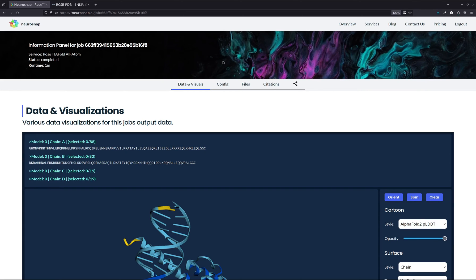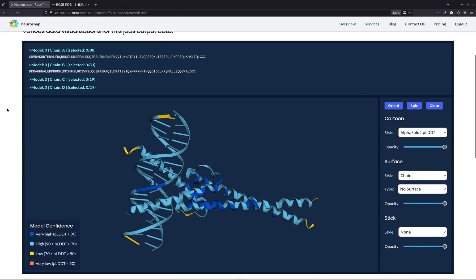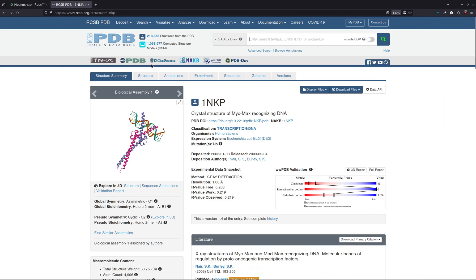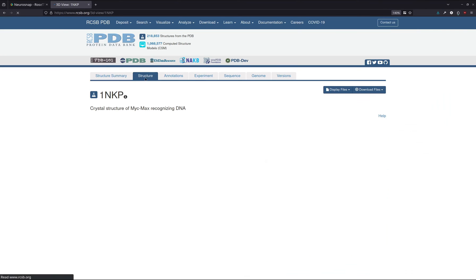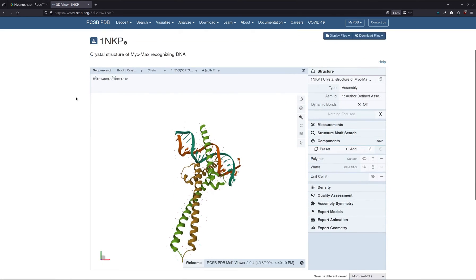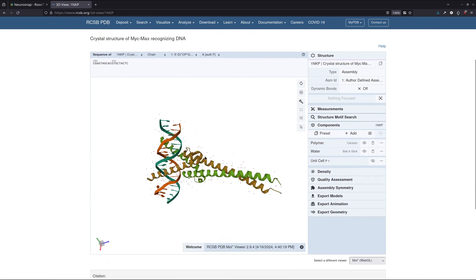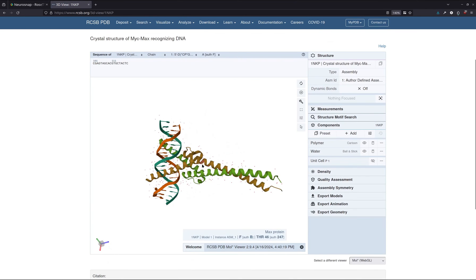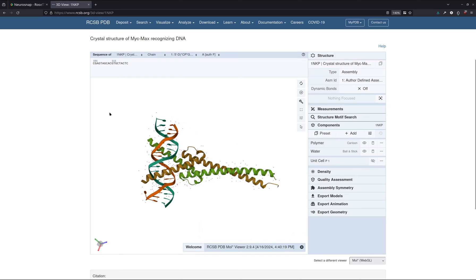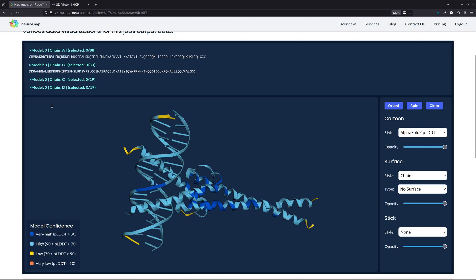And as we can see, this job went by fairly quickly with a runtime of only about one minute. So looking at the structure, it already looks quite promising, especially when we compare it to the experimental structure on the PDB. We see that both the Myc and Max proteins are interacting with more or less the same region of DNA. So this is a great sign right off the bat to see that kind of consistency.